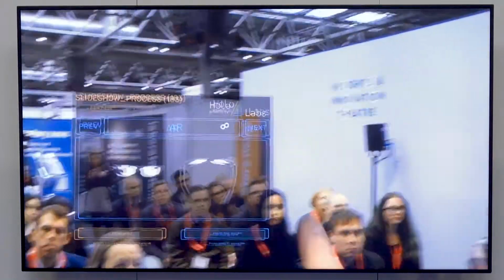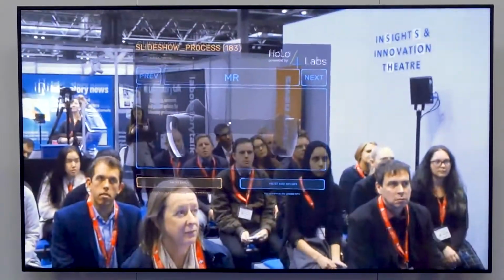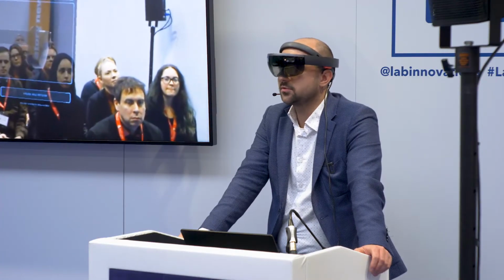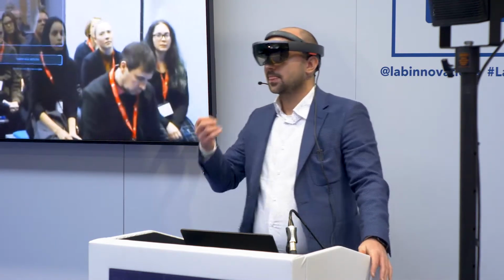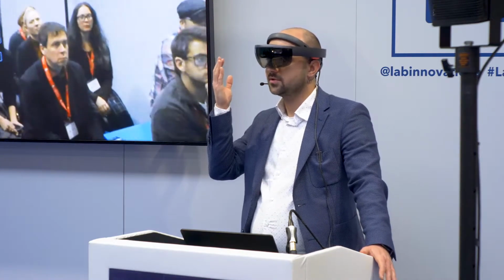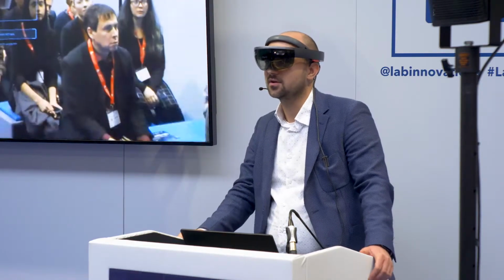And the MR. I'm currently wearing the MR glasses, so the glasses that are combining augmented reality and virtual reality. You have the picture in front of you, but you have completely transparent glasses. I can see you, and you can see yourself also on the screen.